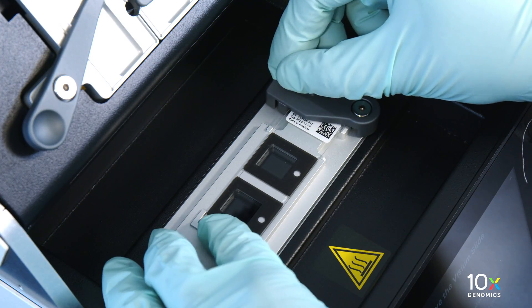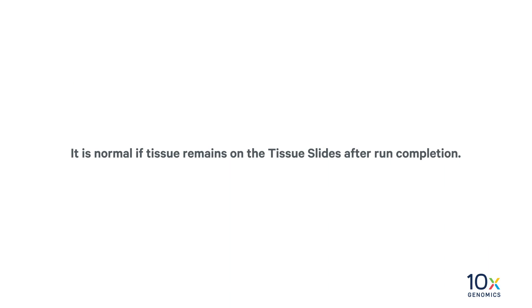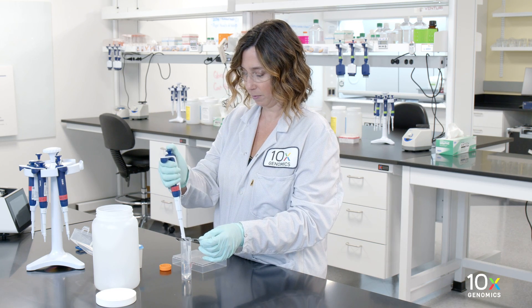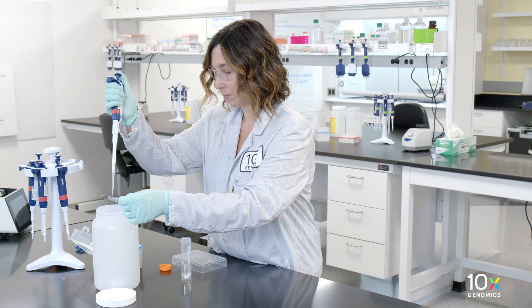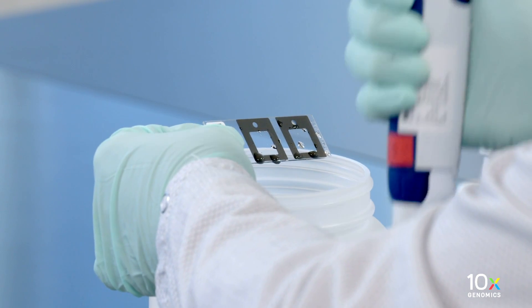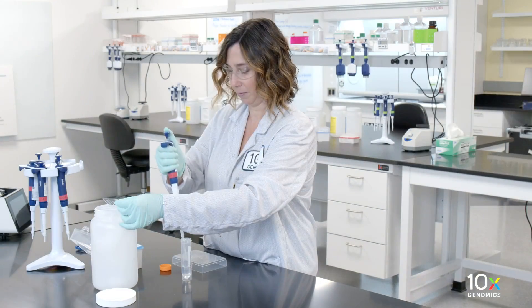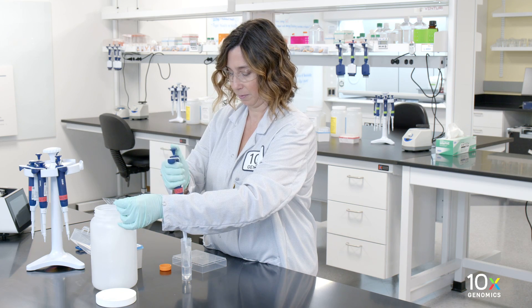Remove the Visium slide assist spatial gene expression slide. It is normal if tissue remains on the tissue slides after run completion. While holding the Visium slide assist spatial gene expression slide over the liquid waste container, rinse each capture area with 1 milliliter of 2x SSC. Do not pipette directly onto the capture areas. Rinse the slide near the Visium slide assist instrument to ensure prompt washing. Repeat 2 more times for a total of 3 washes.